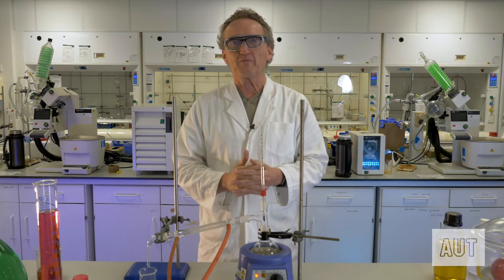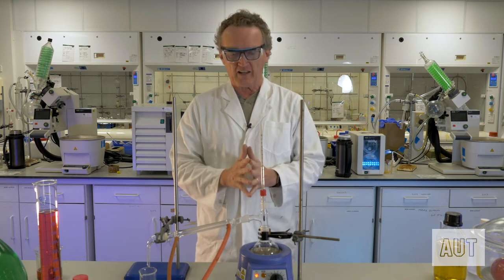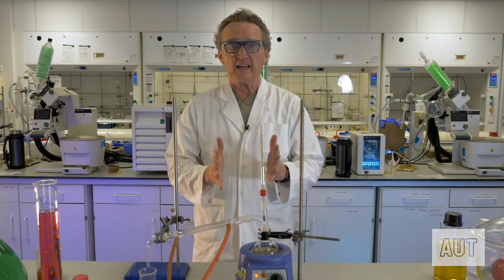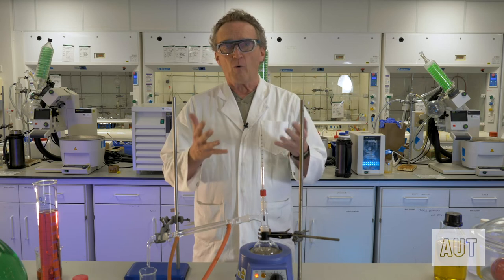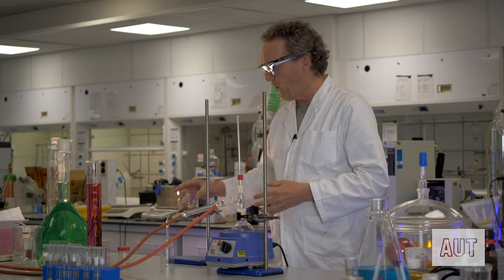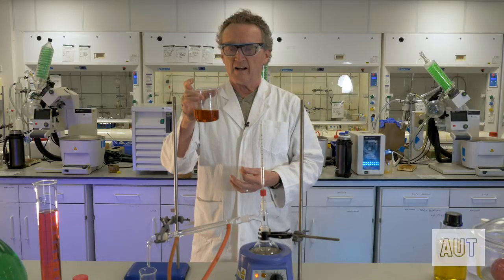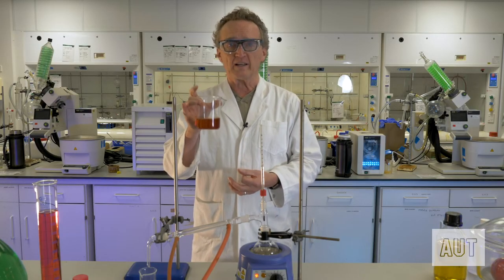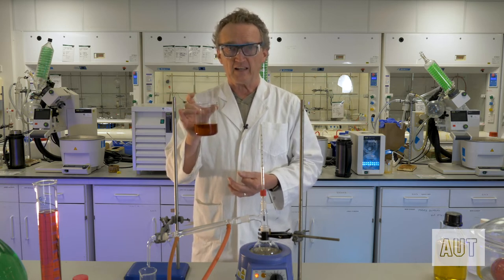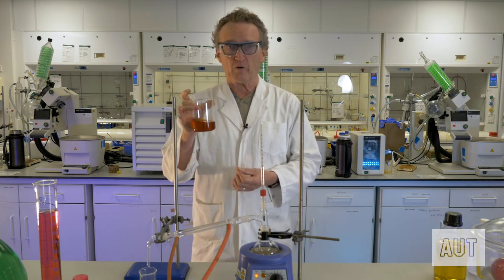So now we've set up this impressive looking piece of kit. What are we going to do with it? What's the whole point of a distillation? Well, what a distillation does is purify a liquid or a solution, or get one component of a solution free of the other component. So today we are going to distill this liquid here. And hopefully if we do this all correctly, we're going to end up with a clear, colourless liquid at the end of all of this. So we're going to purify this mixture into one of its components.